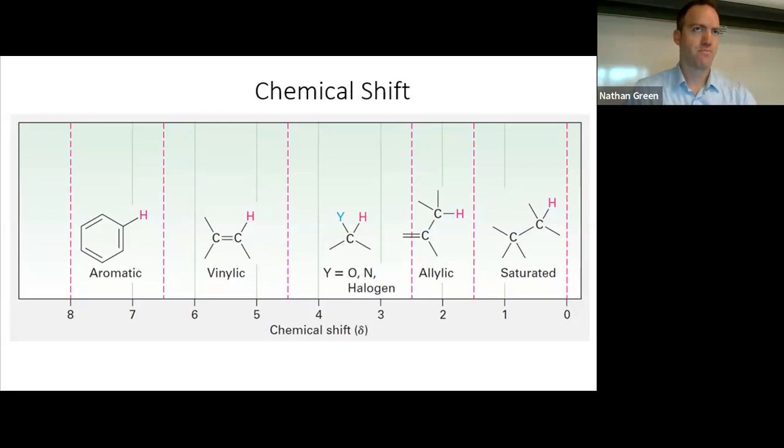would show up. Those words you're going to hear me use, I would say this proton is downfield of this proton. It is in a less shielded environment, so I don't have to have my radio frequency as loud. That carbon's sp3 hybridized, that carbon's sp3 hybridized, that carbon's sp3 hybridized. All the carbons have the same hybridization. They're all sharing equally. It's what's happening outside of the carbon that's influencing it.